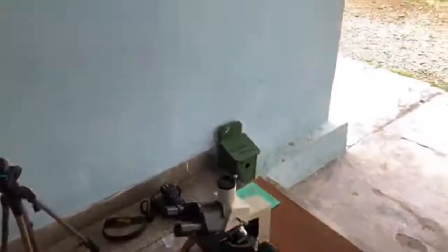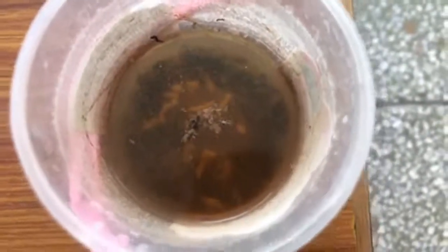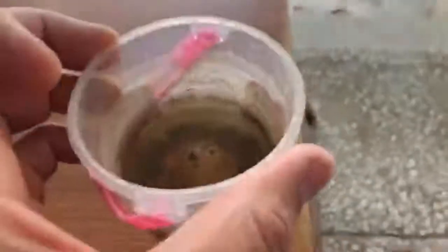The sample here is this water. This water has been sitting on this table for a while now. It was collected from a bird feeder. So you can see there is a coloration. It's become kind of reddish due to whatever, I don't know. And there are some small dark stuff floating on the surface. You can see that.